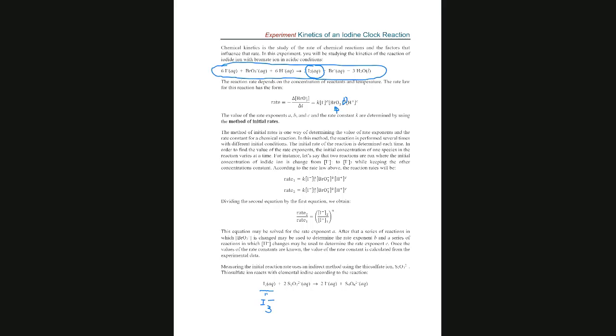As long as the thiosulfate ion is present, the iodine, or triiodide as they say, produced in the first reaction is consumed by the thiosulfate ion. The moment all the thiosulfate is used up, the concentration is zero, and the iodine forms a dark blue color with the starch complex.